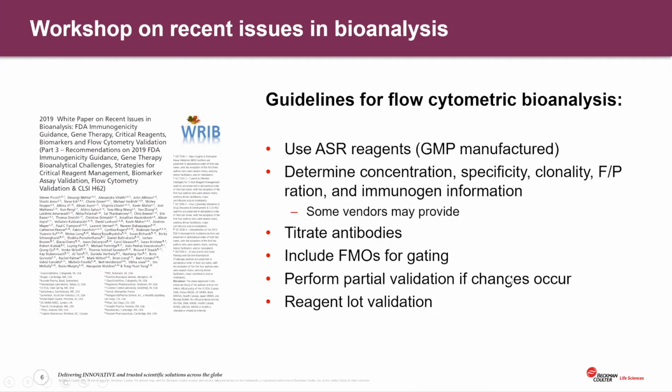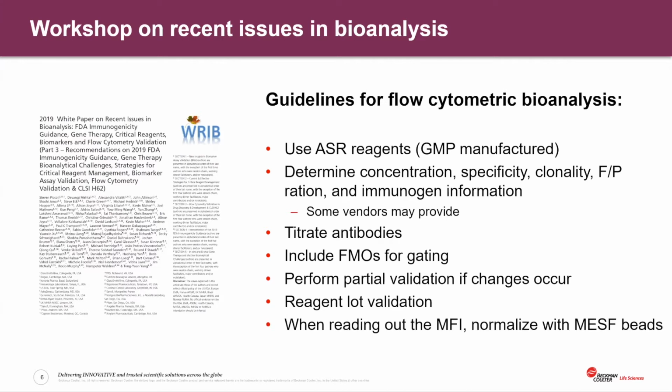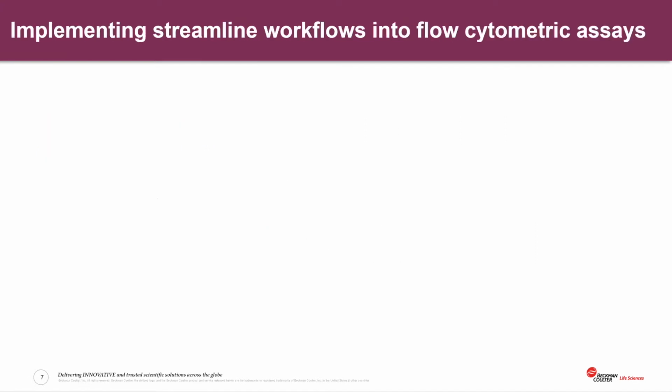If you are changing lots or changing reagents, ensure that partial validation is performed. And then when reading out the MFI in terms of activation markers, such as your CD69, ensure that you are normalizing with MESF beads. So those are just a few specific guidelines that we've gotten from the workshop.